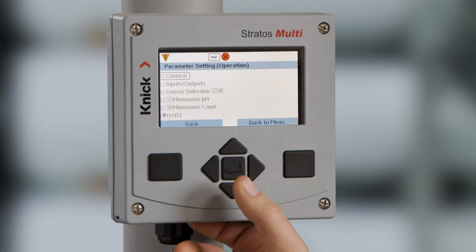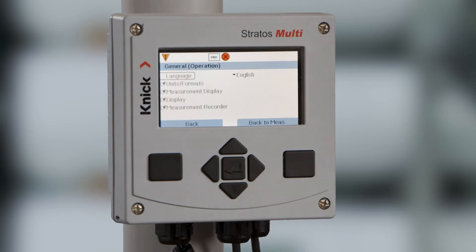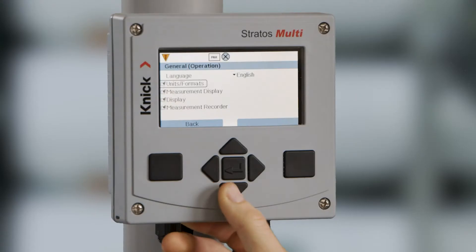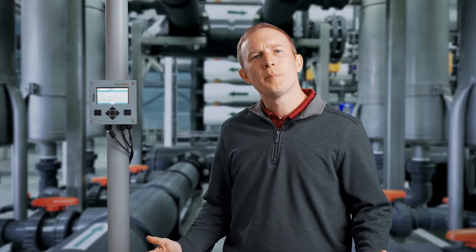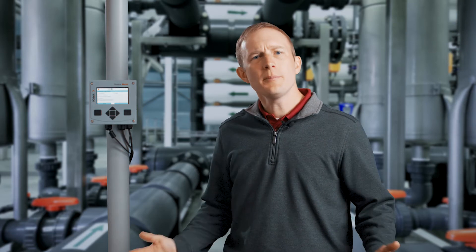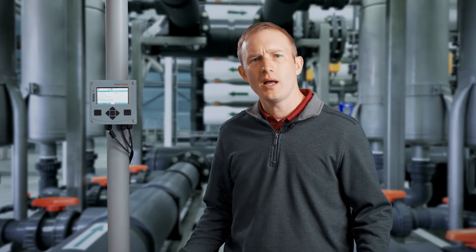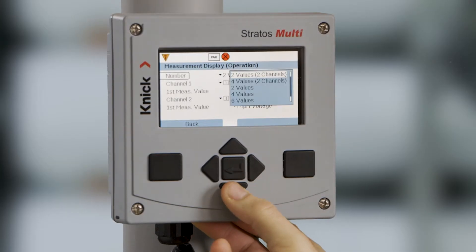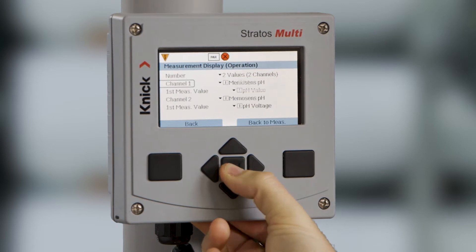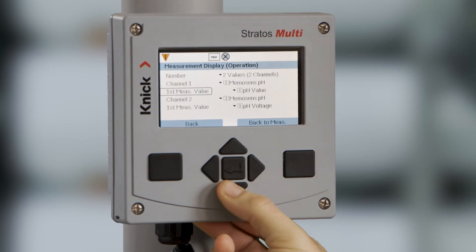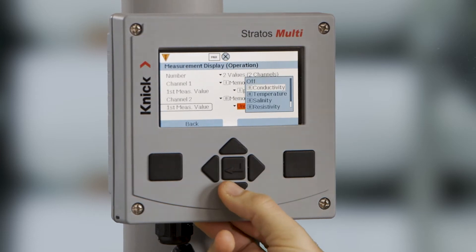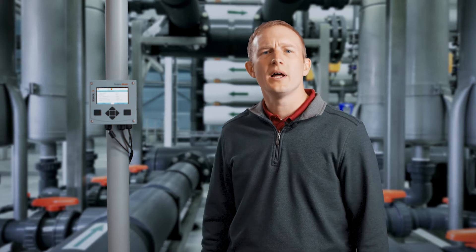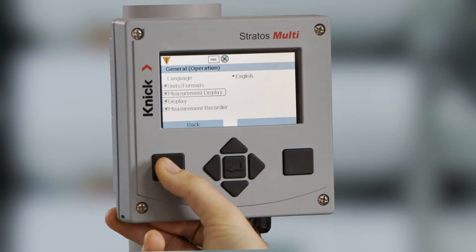The first menu we will configure is our general operation menu. Within this menu, we can select the displayed language, our desired units and formats such as degrees Fahrenheit and PSI, and our displayed measured values for the main screen. If you have purchased the option for the measurement recorder, it can be configured within this menu as well. We will select our desired units of measurement as well as our displayed values on the main screen.